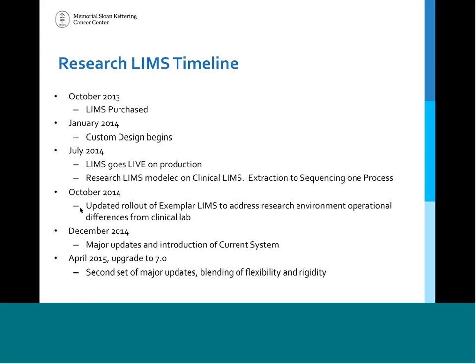We had a number of issues, and we realized that in order to really be as flexible as we needed to be in the research setting, we just had to rethink the way that we were processing the samples through the LIMS. So we actually scaled back, we took the system offline, and then we went online again in October 2014. And since then, we've been running relatively smoothly with some updates that we did in December 2014.